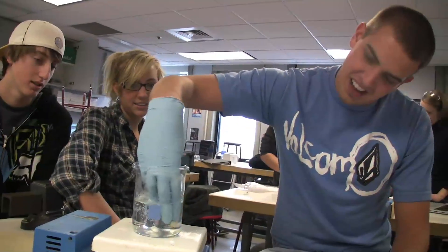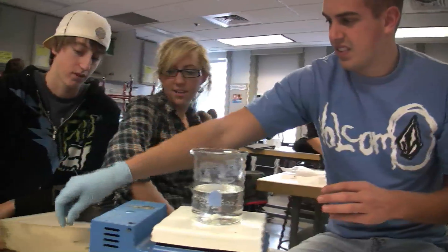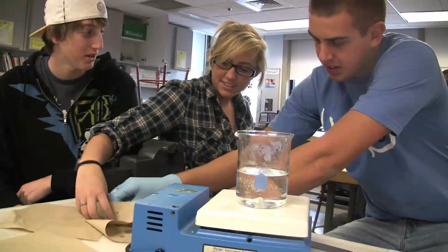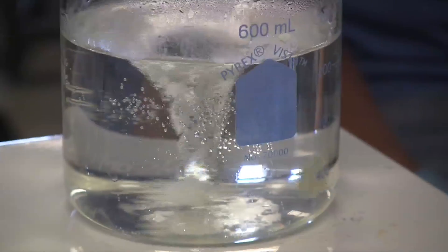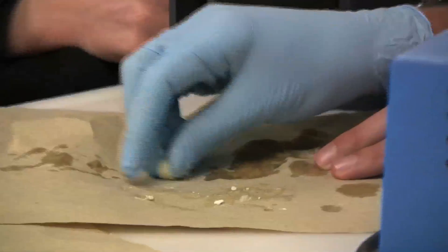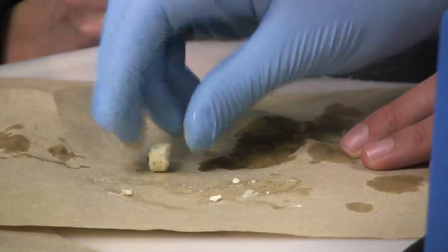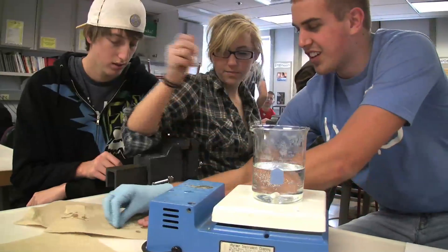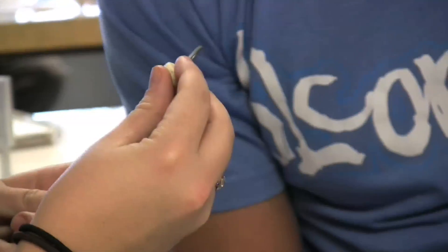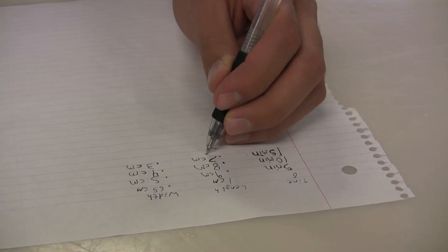What we're doing here is testing how the pill will degrade in the mouth and how long it will take. We spun it using this and heated it up to 37 degrees Celsius, which is the temperature of your mouth, and saw how fast it degraded. There's also a press downstairs that we put the pill under to see how much pressure it takes to break it, so someone couldn't just bite into it.